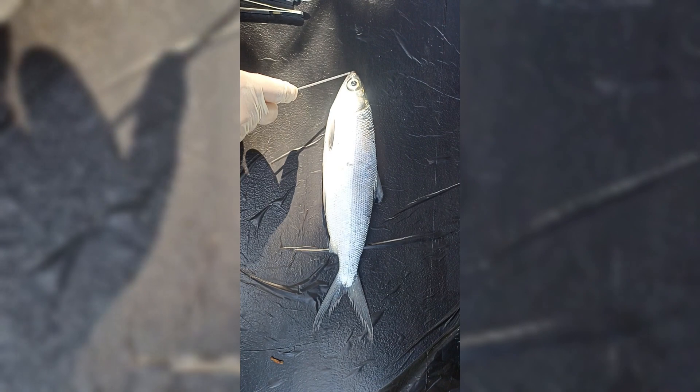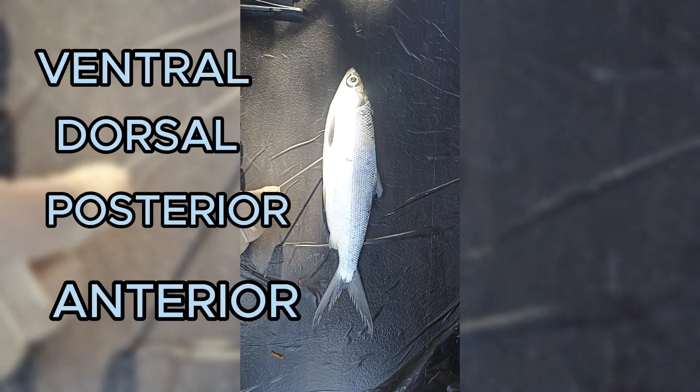First, we will identify the positioning of the fish. This includes the ventral, dorsal, posterior, and anterior parts.